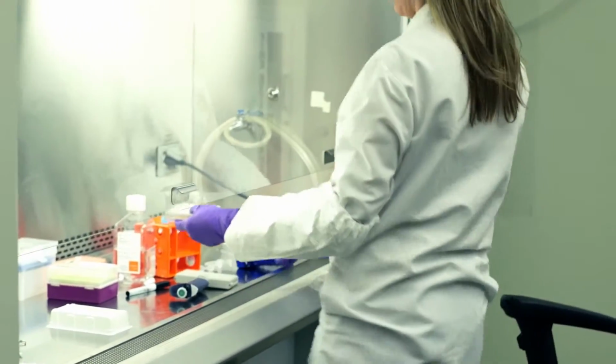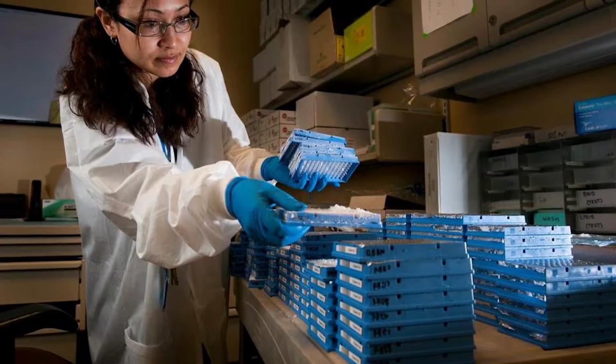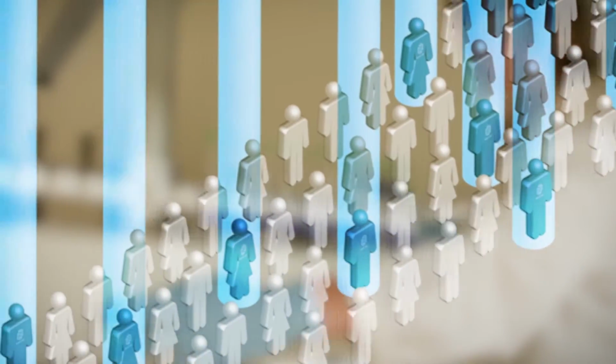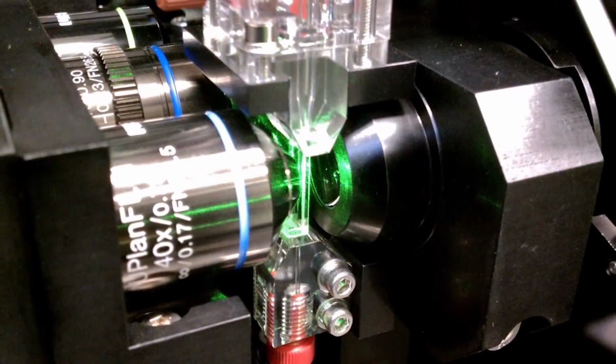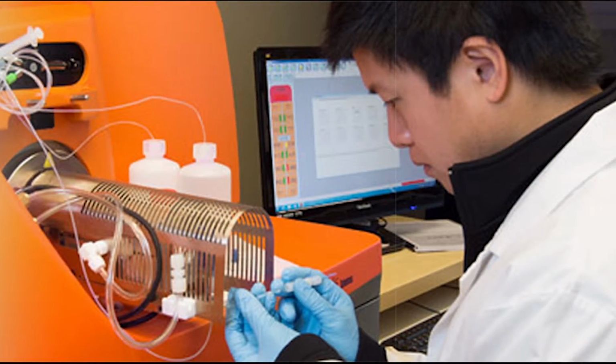We can combine that now with genomics, because the other aspect of flow cytometry, there's two parts. It's analytical, and you can identify a cell, but you can also sort it out. So we can sort out that single cell and do single cell genomics and get very specialized precision medicine for precision diagnostics. That means we can ask a lot more questions. What it also means is we have a lot of data.